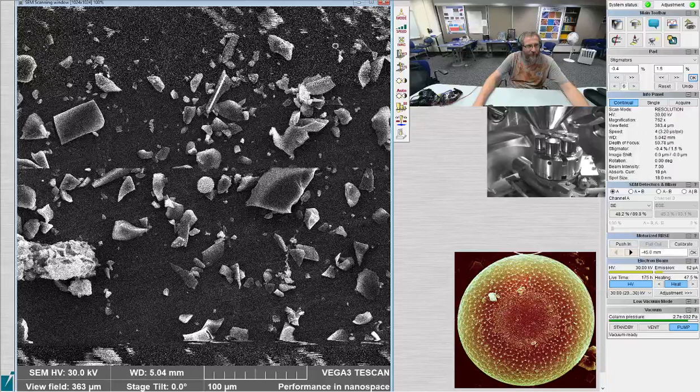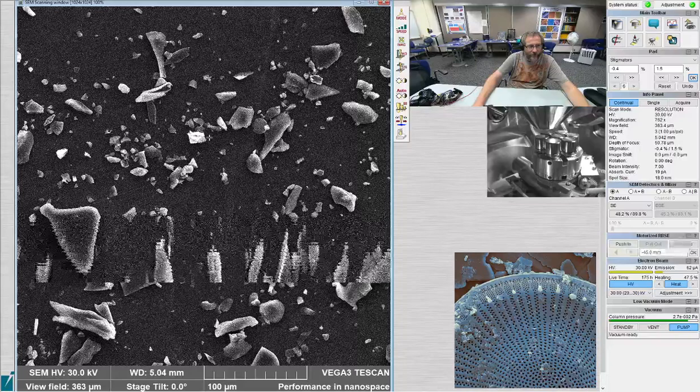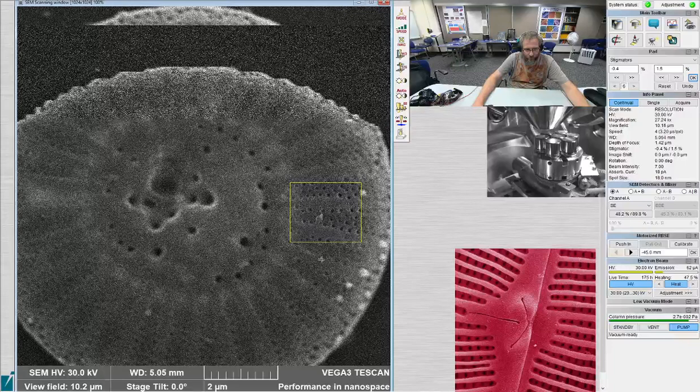So, actually, pollen shouldn't have floated in the heavy liquid. Good point. Did you do a really light liquid and then a really heavy liquid, so you have multiple layers, or did you just do two? No, I just put it in the sodium polytungstate. So everything floated to the top. And then pipetted off.